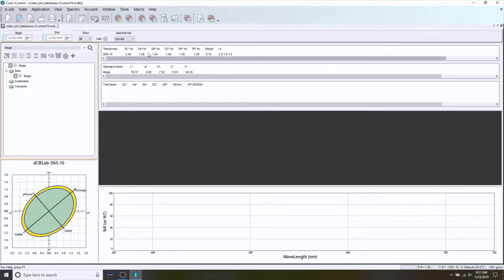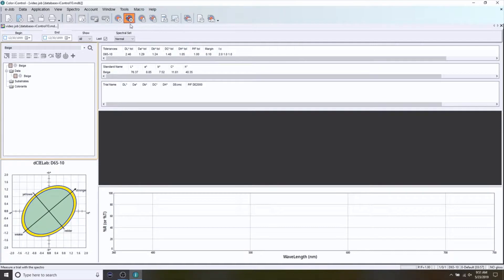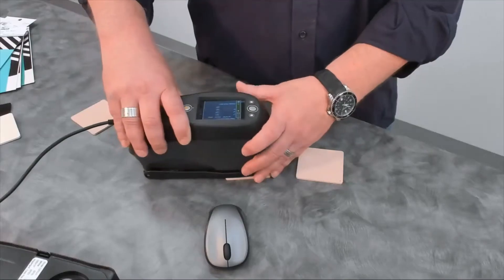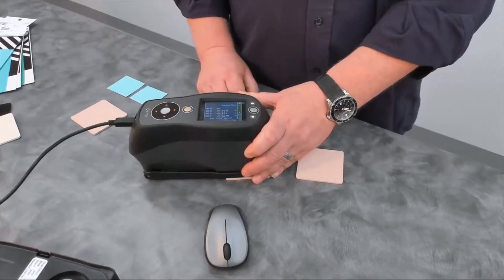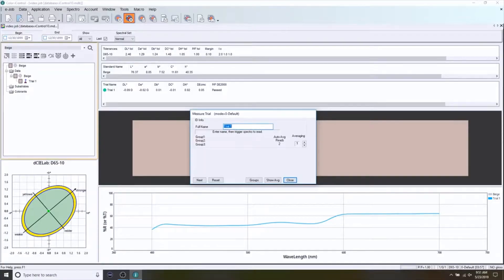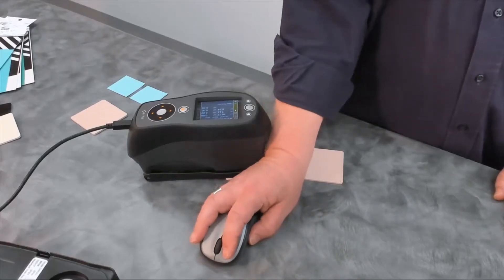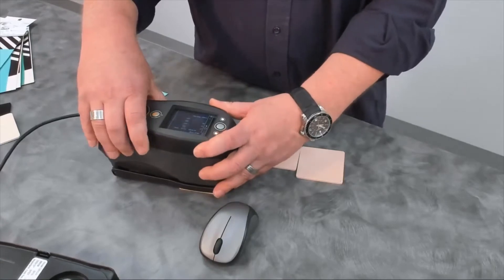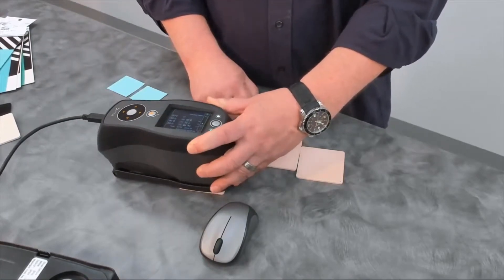Let's measure a couple of samples to compare to that. What we call those in IQC is Trials, and the icon for that looks like a dart or an arrow being thrown at the target. So we click on that and it's going to prompt me for a name — I'll simply call this Trial 1. I take the instrument and measure, and it captures that. I can see right away with the little green indicator and the word 'passed' that the trial passed against my standard using this tolerance. If I want to measure another trial — let's say Trial 2 — I can come in here, backspace and type Trial 2, take a measurement, and I can see that one passed as well.